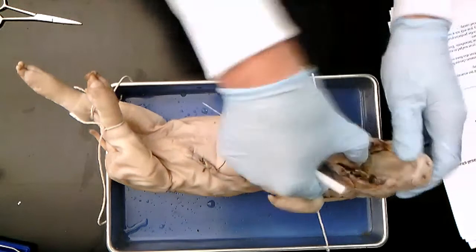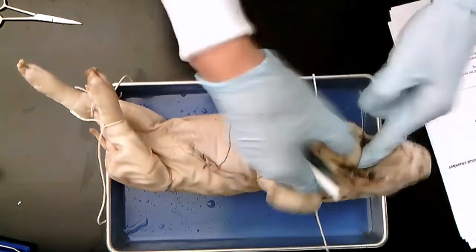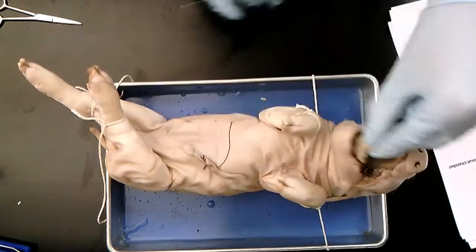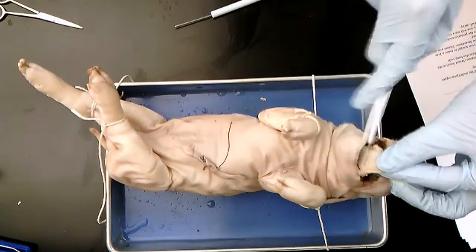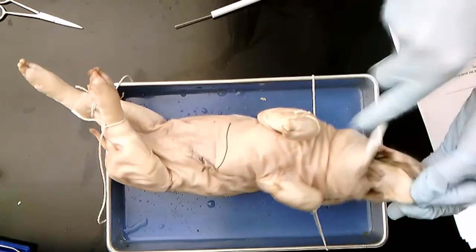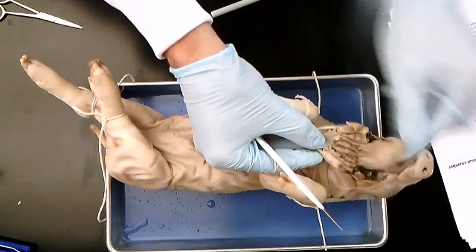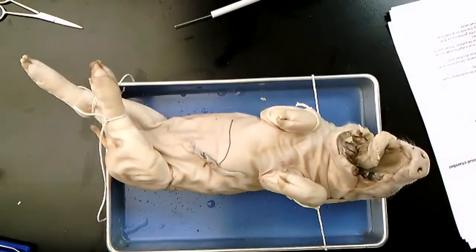Then they're going to be responsible for identifying the nasal chamber as well as the tongue, which is right there. One thing with the tongue, if the students want to, when they are preparing, make an incision and make the tongue a little looser, where they can get into that mouth cavity easier, that's all right.